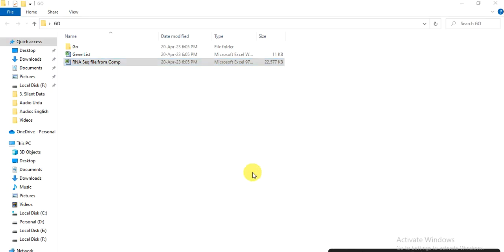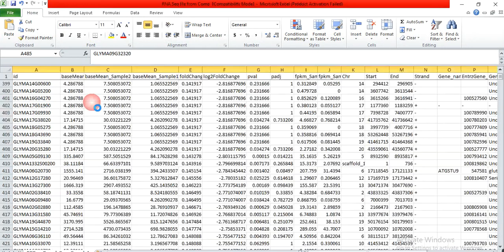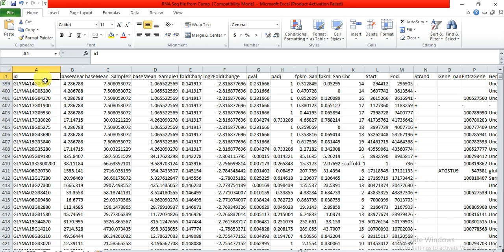When you do the RNA sequencing of your data, you will get this type of file from the company. For example, I have done overexpression in Glycine max of one of my genes, done the RNA sequencing of those lines, and received the data from the company. One of the files is an Excel file with this type of data.